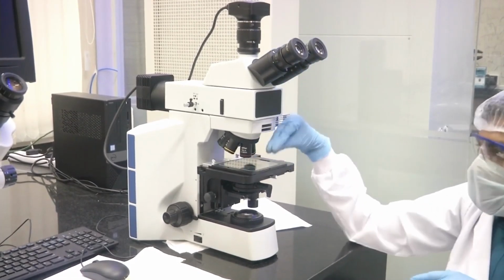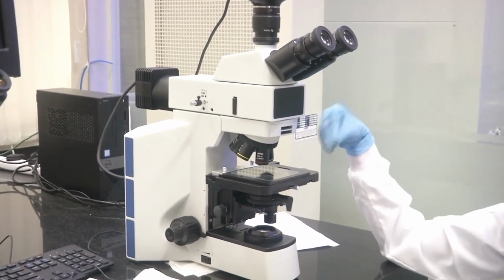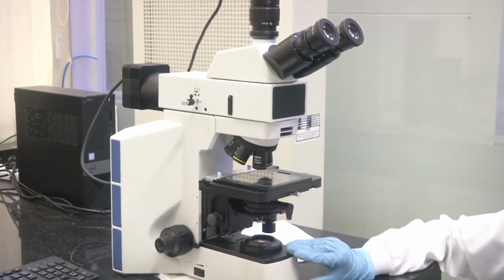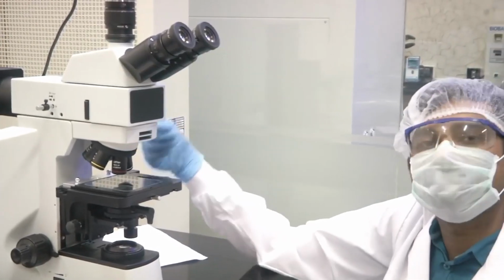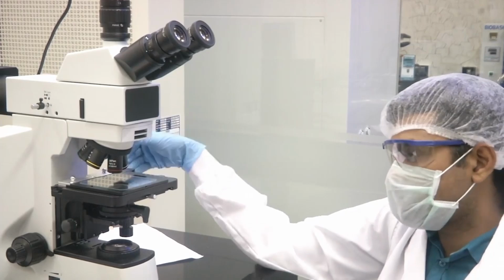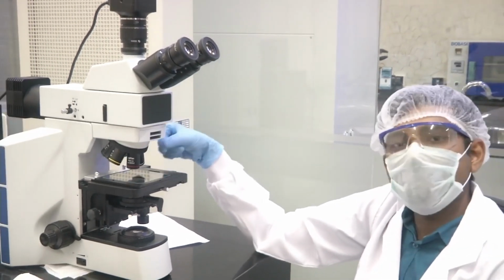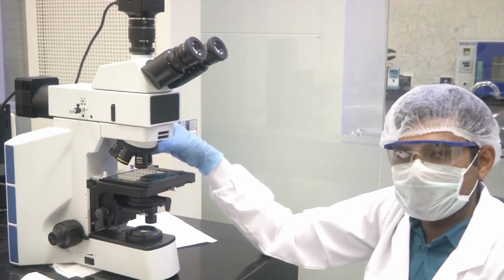So the light is either transmitted or reflected light. The metallurgical microscope can work in both transmission mode and reflection mode. If we are using bottom illumination, it will work in transmission mode. If we are using top illumination, like I showed, it will work in reflection mode. And the reflected or transmitted light from the sample is first captured by the objective.